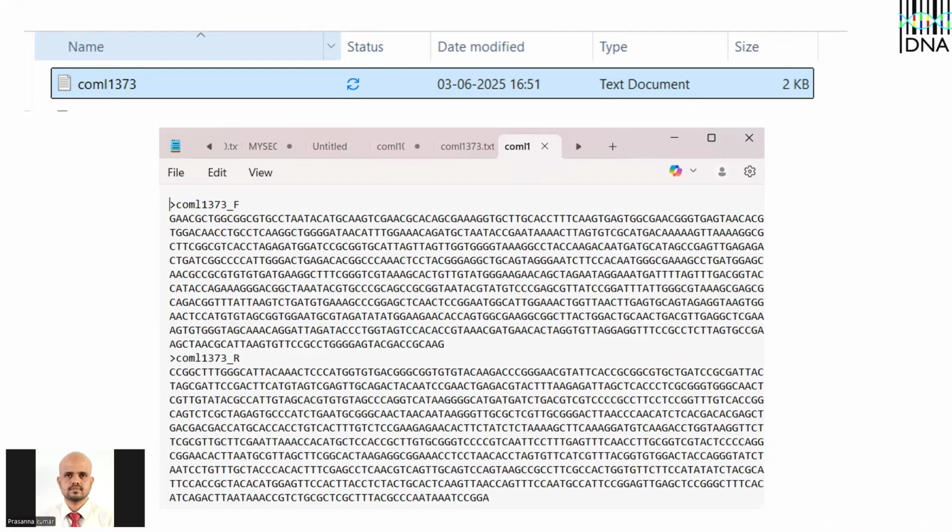They will purify the PCR product. They will split the sample amplicons into two, like we saw yesterday: forward and reverse single-strand amplification for PCR. They subject every sample as two reactions for Sanger sequencing. Once sequencing is done, you will have forward sequences and reverse sequences. So you have to manually inspect the chromatogram and edit it using BioEdit. Usually the sequencing department may do this, or sometimes they will send the machine output file to the bioinformatics department.